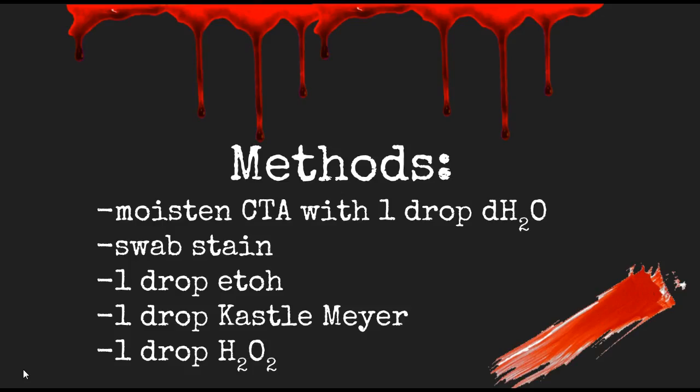So don't add any of these test reagents directly to the blood stain. You're going to pick up a little bit of blood stain with the Q-tip, and that's what you're going to use. So let's get into it. It's a pretty basic test to carry out.